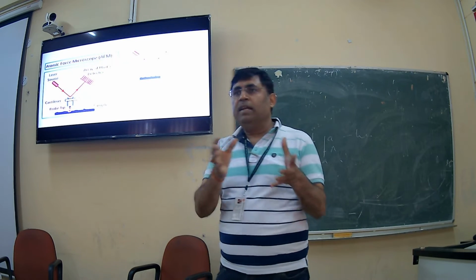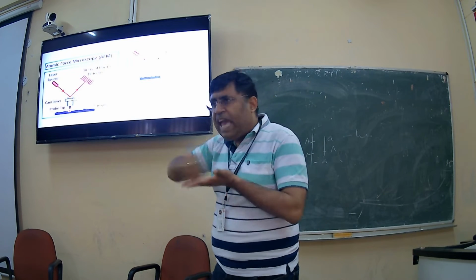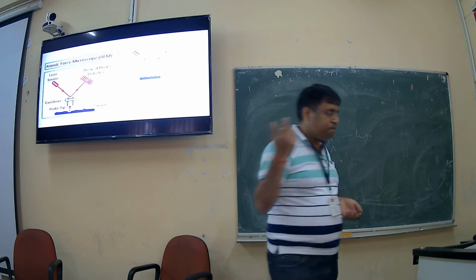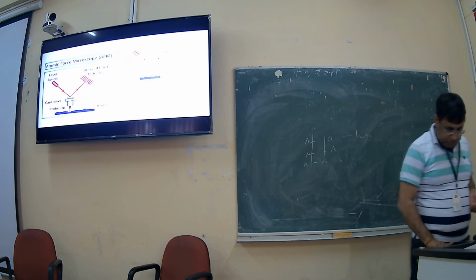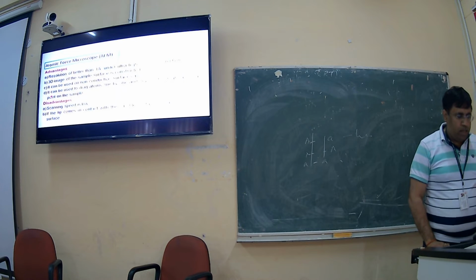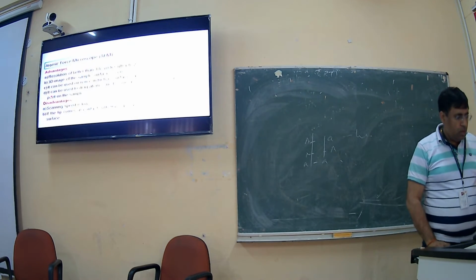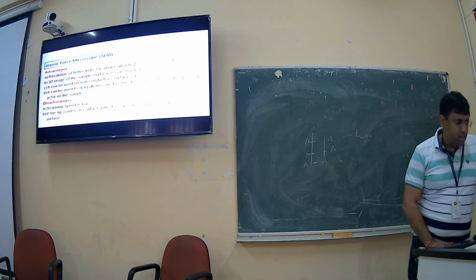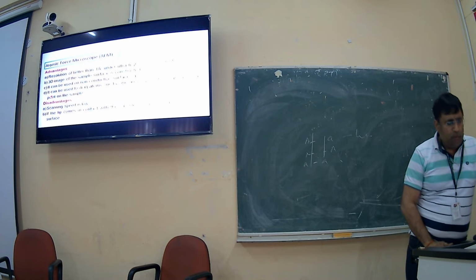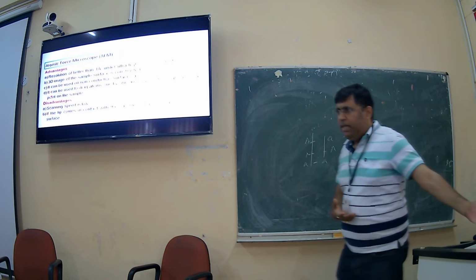So these two come under scanning probe microscopy. In both you see the probe is there which will scan the surface of your specimen. Okay. So advantages and disadvantages of atomic force microscopy, you can read it. The resolution is better than what I told you. I told you about the basic methodology, how it works. Now you can read it.